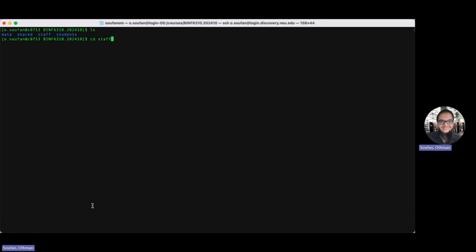Now one thing I will go to, which is data, ls, cd qualities and GC content. Now we have 3 files. We have FASTQ files, one for forward and one for reverse read, and this is st.py. It's the program that we are gonna run.